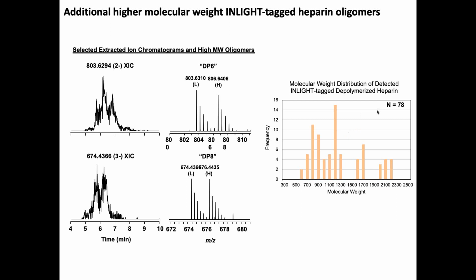All of them, yeah. So I think there are a couple of different ways you can do it. If there's a case where you have a modification site and you don't know where it is, you know it's there, but you want to be able to establish where it is because it can have serious implications. When I mentioned to you about using enzymes, you don't ever want to just say, oh, the instrument's going to take care of it all.